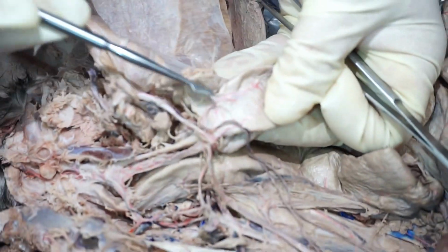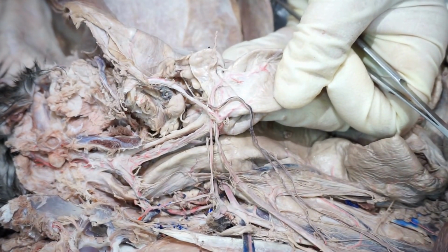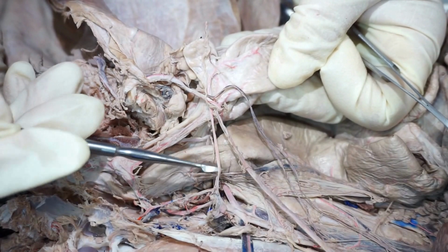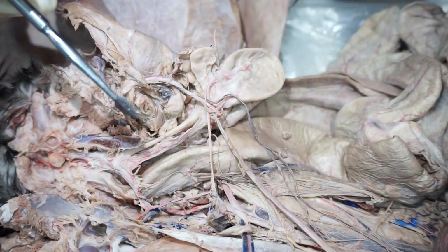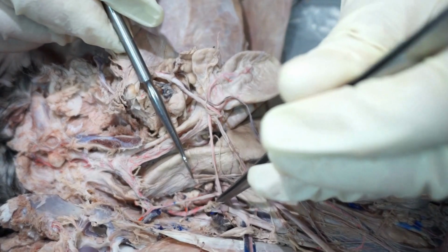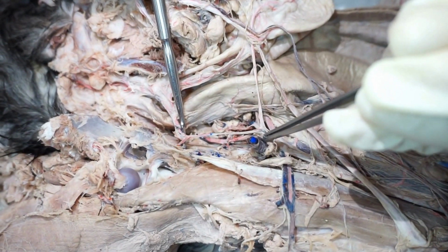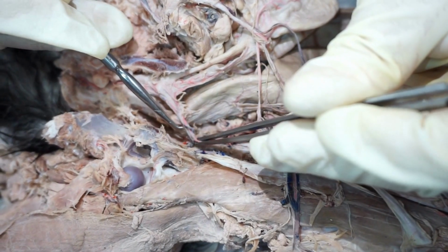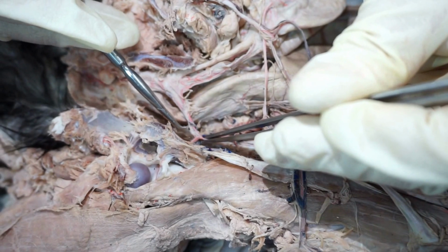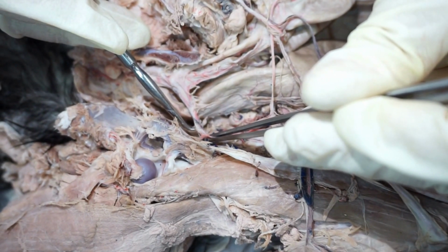Oh, that's pretty. Oh, that's even better. It's the cranial vesicular. Okay, so that's an awesome example of that umbilical coming to the bladder. Then the internal iliac continues a long way before we finally give off the caudal gluteal, which is what we've been looking for.